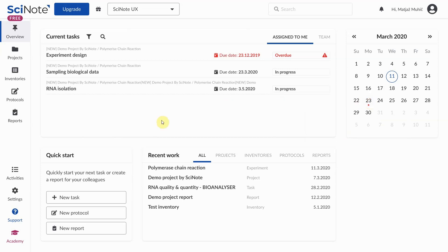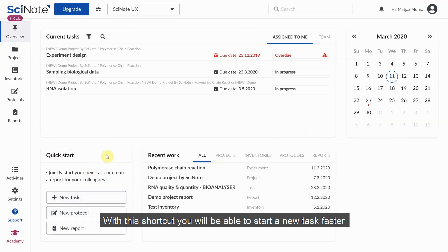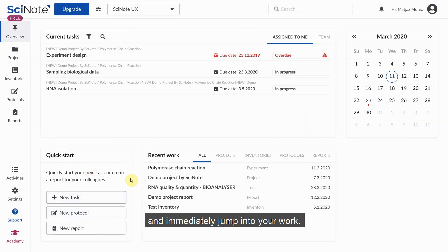The quick start section aims to increase the speed of creating common SciNote items. With this shortcut, you will be able to start a new task faster and immediately jump into your work.